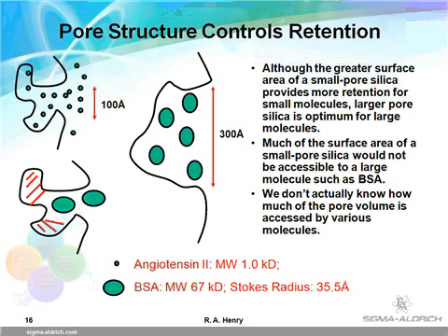When sample molecules are comparable in size to the pores, poor recovery is also often noted. Larger molecules are usually separated on columns with particles having larger pores in the 200 or 300 angstrom range. Very large molecules may require particles with even larger pore sizes, although they can lose the benefits of mechanical strength.